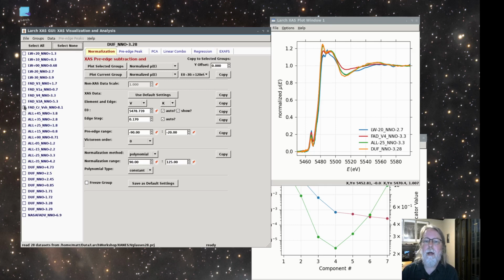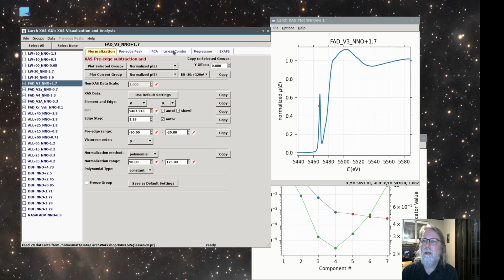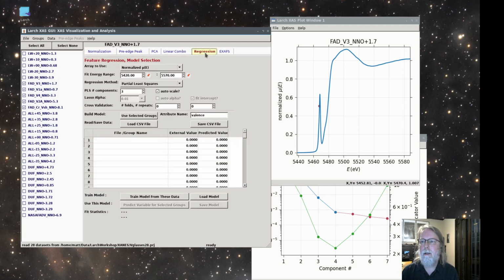So we can do that. That's one of the first approaches to machine learning, to look at some observations, some spectra, and from those extract an external variable. That could be anything you know about the sample, but including, say, oxygen fugacity, which is the value you really want to be able to extract from the data. So to do that, there's a regression panel, and that's just linear analysis. That's just mapping of the spectra to this single value.